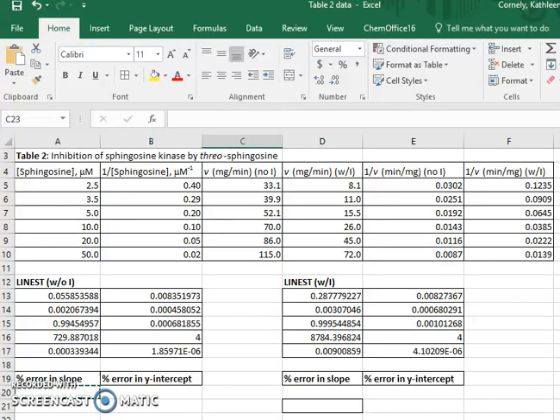I've just completed table two, and I've just completed a line-est function analysis on the data without the inhibitor and with the inhibitor.